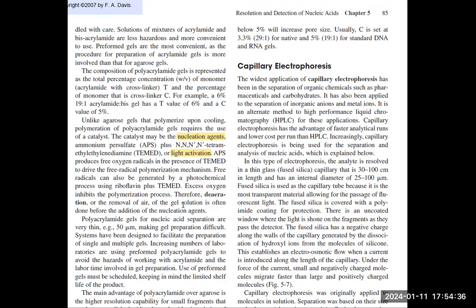because air, or too much oxygen, tends to block the polymerization process. Remember, we need free radicals here, not oxygen. See, excess oxygen inhibits the polymerization process, so it will not harden. Or if it does harden and you still insist on using that, there will surely be a problem in migration. Okay?